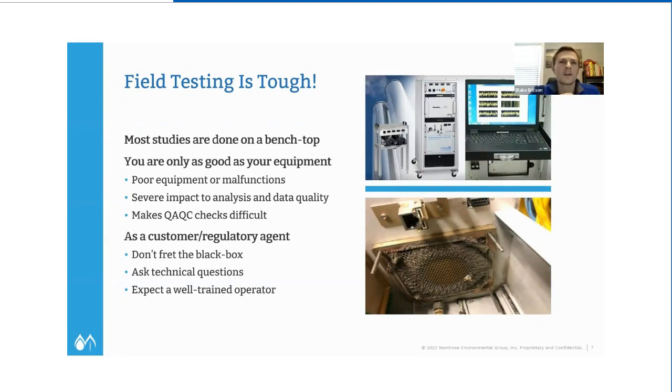And then if you're a customer or regulatory agent listening into this one, don't be afraid of the FTIR. It's not the black box, the voodoo box. I'm sure I'll say this again. It is a very powerful instrument when it's used in the right pair of hands.